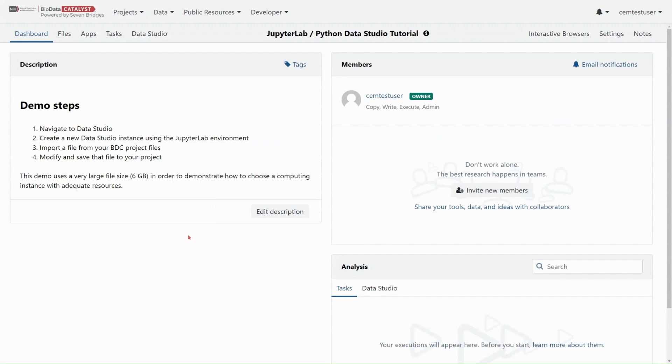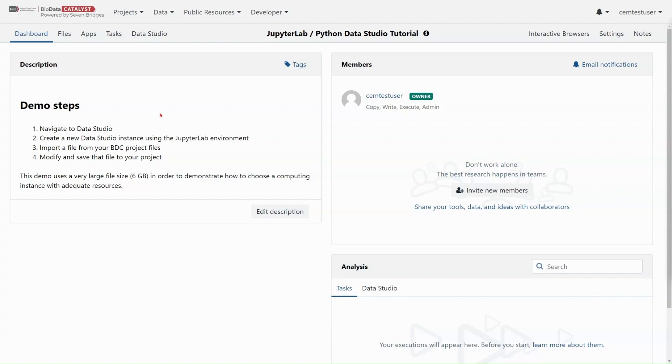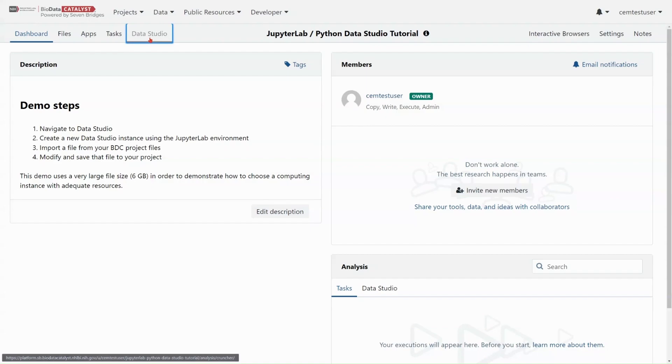This demo uses a very large file size, six gigabytes, in order to demonstrate how to choose a computing instance with adequate resources for large files. Let's begin by finding the Data Studio tab here in the project navigation bar.